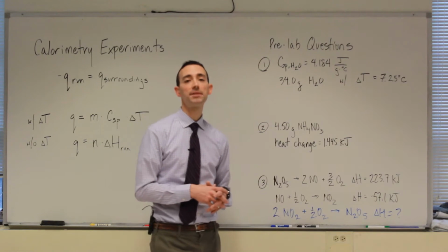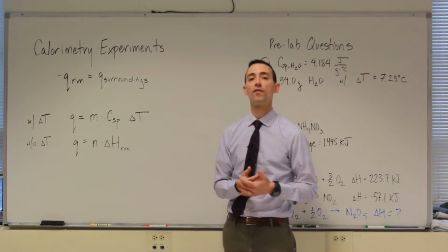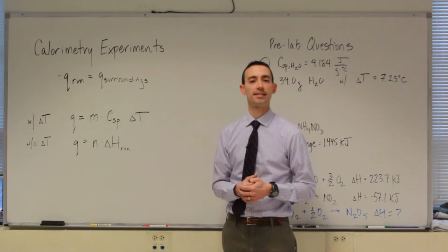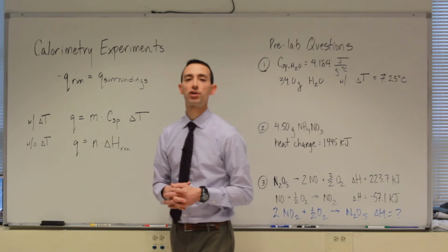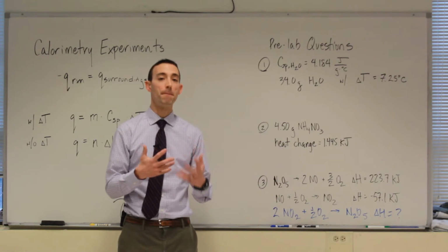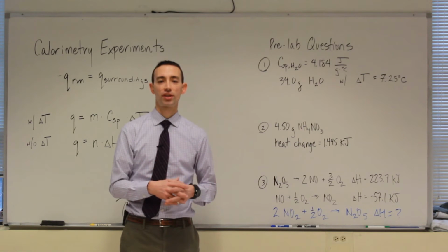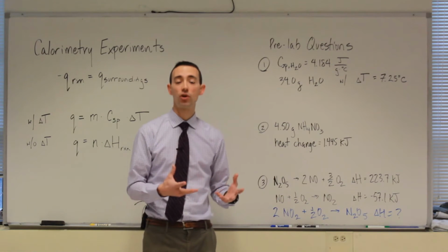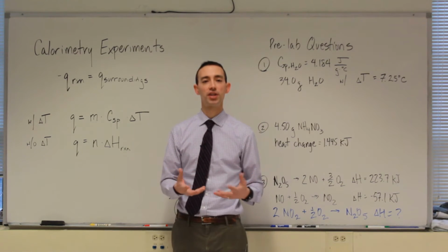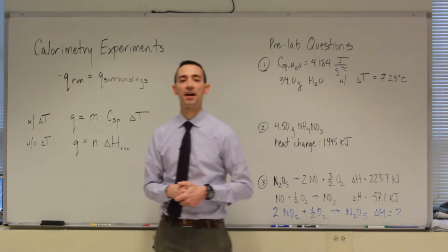So our goal in the lab today is to conduct a series of reactions, 4 different reactions involving 4 different but yet somewhat related chemicals, all reacting with acid, in an effort to see which reaction produces the greatest amount of energy. All right? We're going to use different masses, which is a little bit of a trick in this whole consideration, or a little bit of a decoy, because using more mass might not necessarily mean more energy per number of particles, right? So per mole is how we're going to be quantifying that energy.